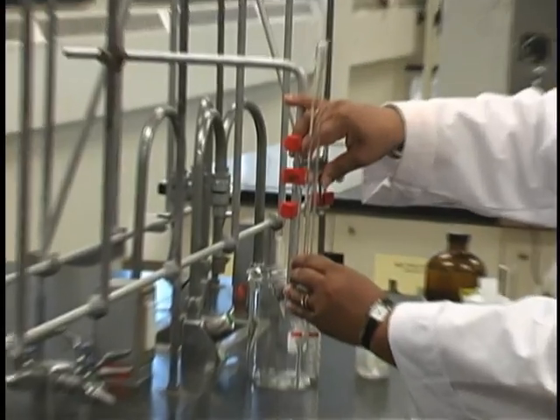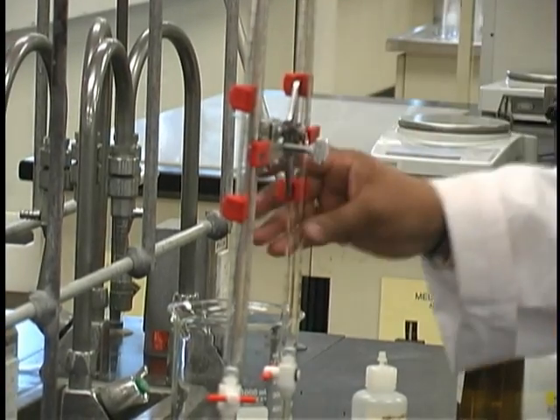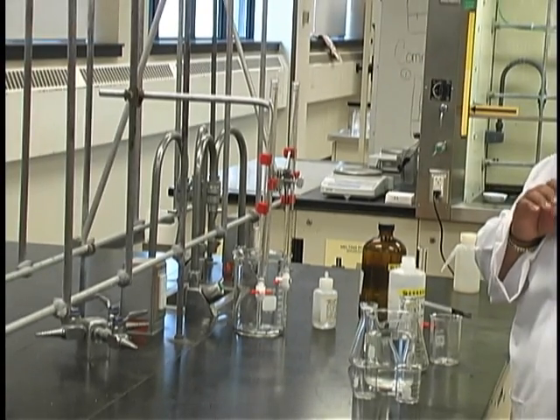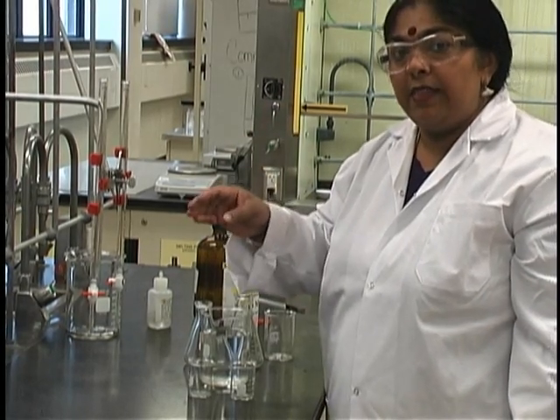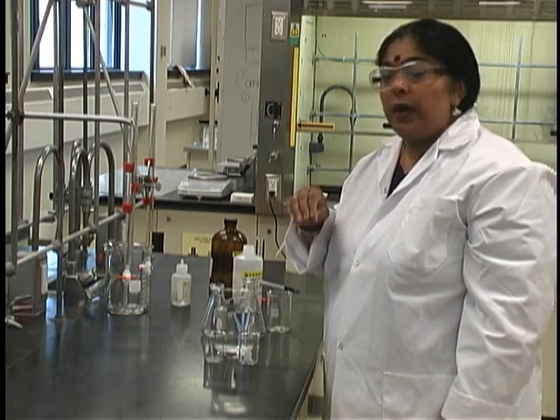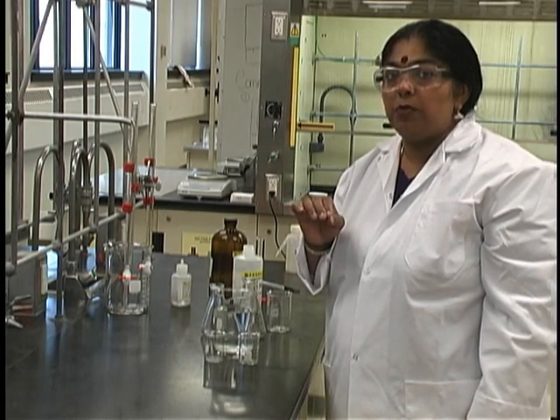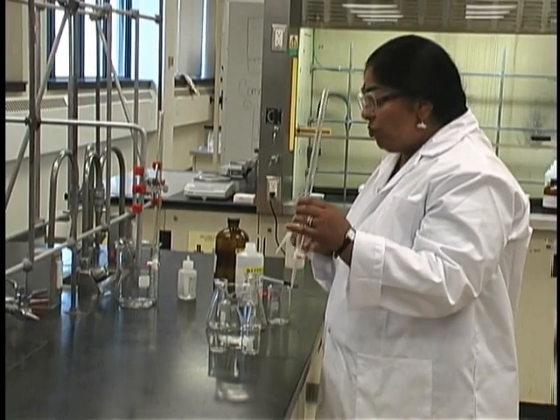You may obtain two 25 milliliter burettes located on carts in the front of the lab. One burette will be for measuring your acid solution, and the other for your base solution. Before you put anything in the burette, you may wash them by rinsing with warm water and then rinsing again with distilled water. Do not use soap because all the solutions being used are aqueous. Once you have done this, obtain a few milliliters of the solution you are going to place in the burette and rinse the burette with that.